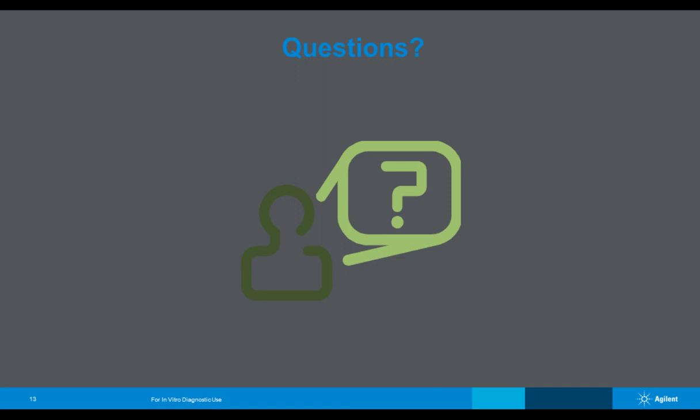Thank you again. And we have time for one more question. Ryan, an audience member wants to know, do I have to use the automated data analysis? No, you don't. And actually, this comes up pretty regularly. So the automated data analysis and the automated reporting has a lot of application for things that are kind of the set it and forget it type of assays. We see this sometimes in some screening assays and things of that nature, and they work really well for that.